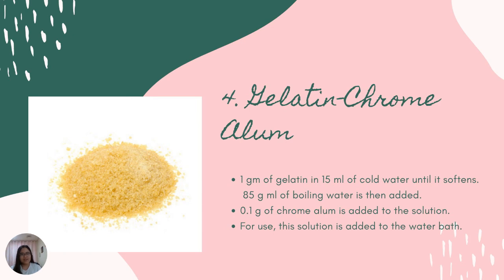Correction, it's not grams, but ml of boiling water that is then added. And then 0.1 gram of chrome alum is added to the solution. And for use, the solution is added to the water bath.